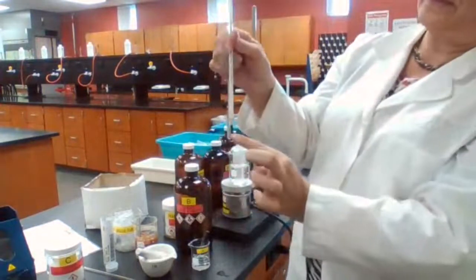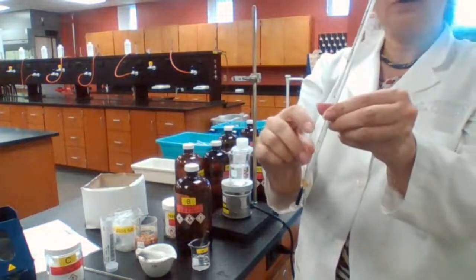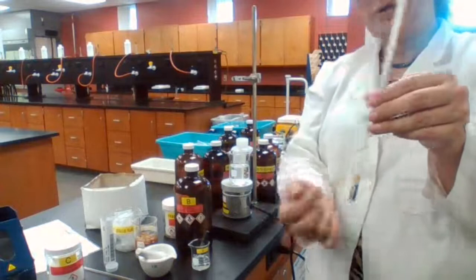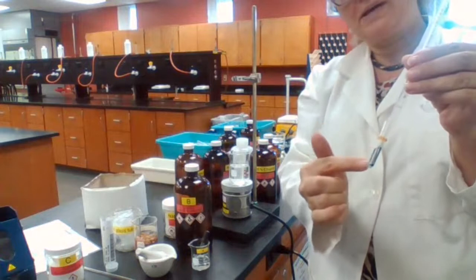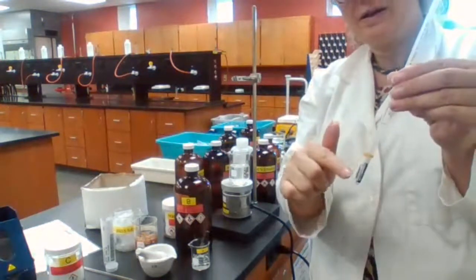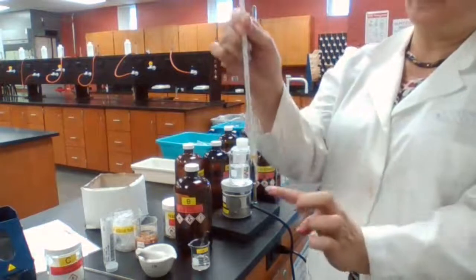What's going to happen when this sample starts boiling? When the sample starts boiling, it changes to gas. And since the end of the capillary tube is closed, the gas doesn't stay in this closed container. It needs to escape the container, so it's going to come out from the open end of the capillary tube. And when it's coming out of the capillary tube, you would see those bubbles. So when you see the bubbles coming one at a time, and kind of fast, we are going to read the temperature here and record that temperature as the boiling point for this sample.